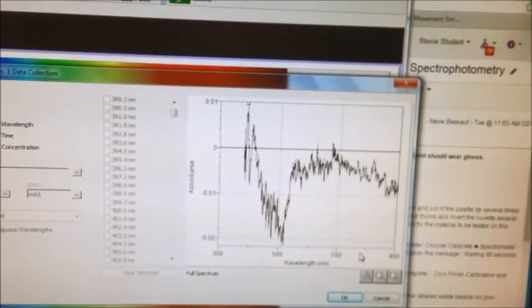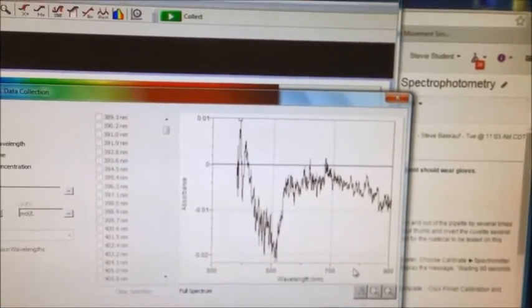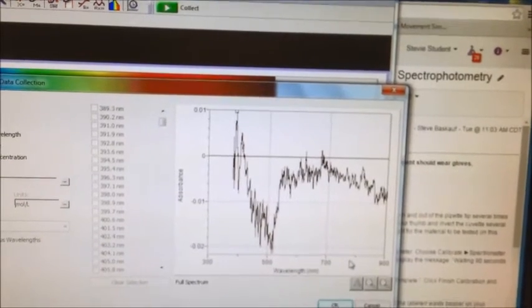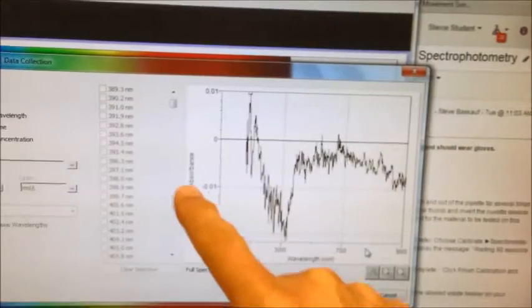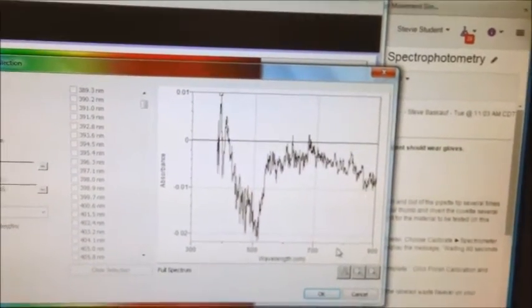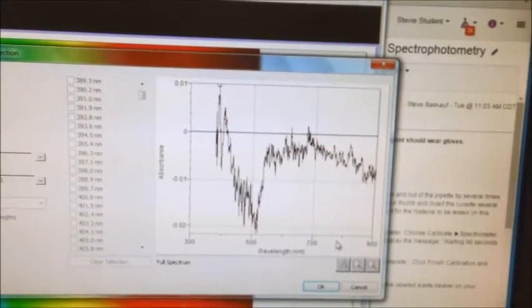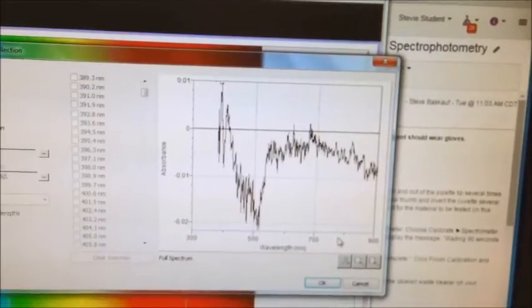That totally makes sense because my sample reading is being subtracted from the calibration reading. And because they're the same, the subtraction is more or less zero at every wavelength. So basically, when I measure the same sample that I'm using for the calibration, I get nothing.